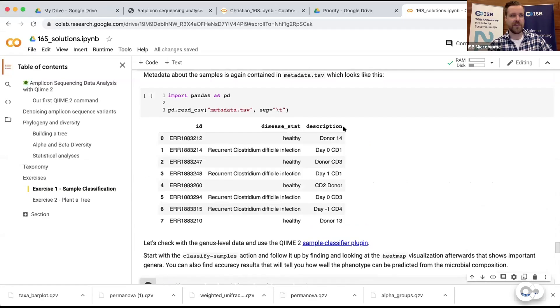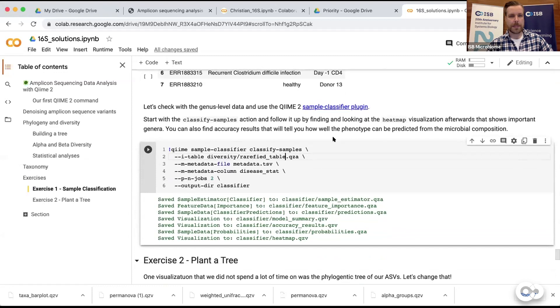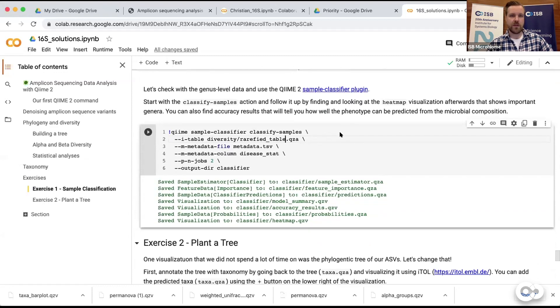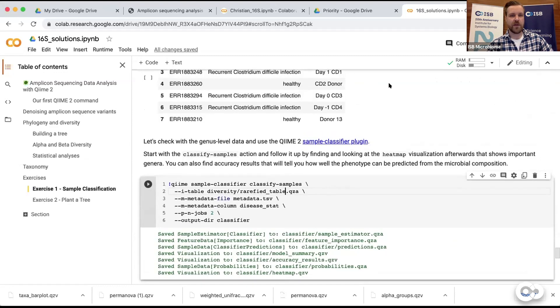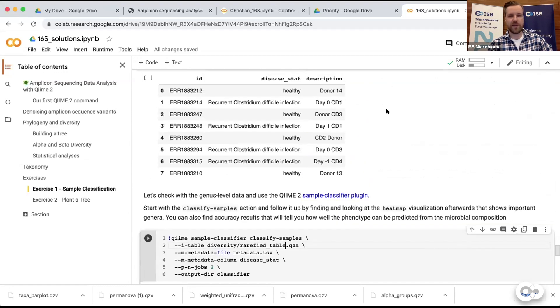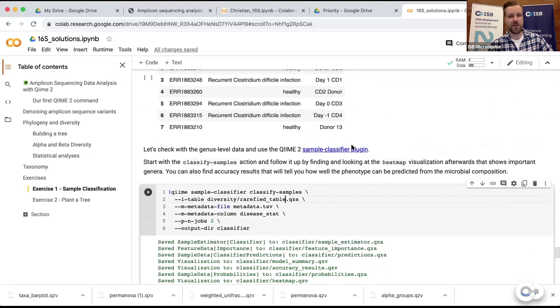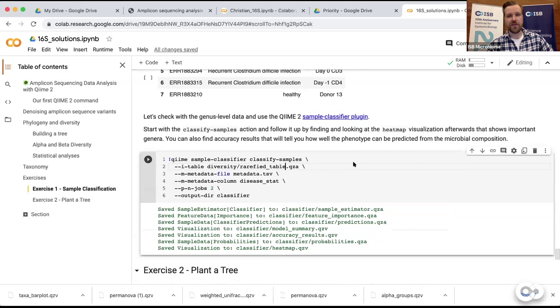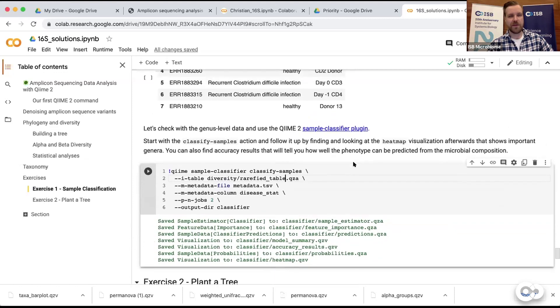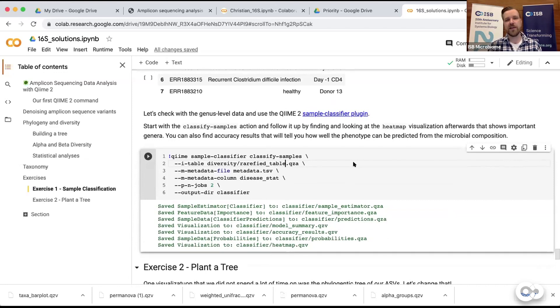Okay everybody, so I hope you all had some time to look at the exercises. I will just quickly show you some example solutions and maybe discuss some intricacies. The first exercise was to basically classify the samples using the data, and the first trap I put here is I didn't really tell you what table to use. There were quite some strategies here - you could have used the abundance table from data2, the genus level table, or the rarefied table from the diversity analysis.